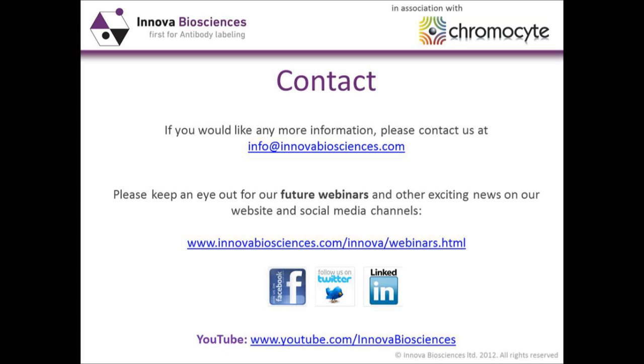That's great. Thanks, Graham. There was one other question here from Tom about the benefits of direct antibody labeling versus secondary antibody labeling. And this is quite an interesting area. There's probably over many years been a perceived wisdom that using a secondary antibody labeling system, either in flow cytometry or in other techniques such as Western blotting, will lead you to increased sensitivity because you're using two layers of antibodies.